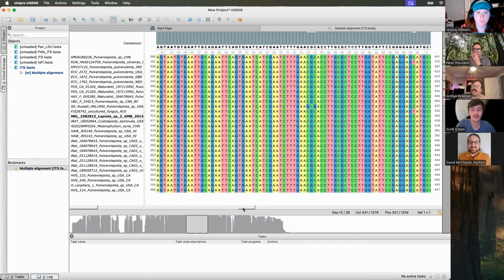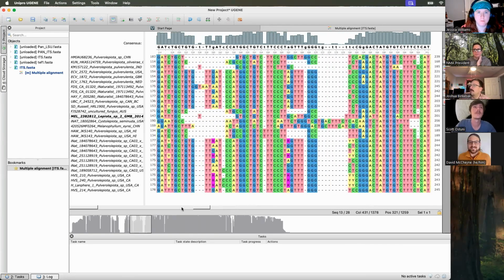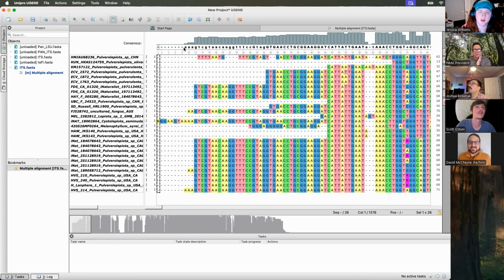Like I said, we are kind of jumping in here. We already put this data set together and cleaned it up a little bit. Maybe we'll want to go and make a new one at some point.